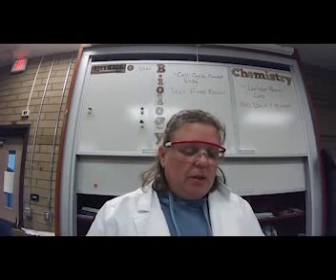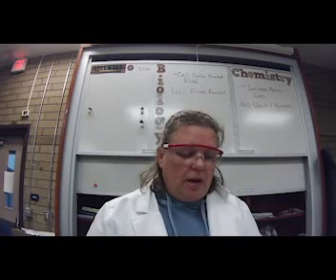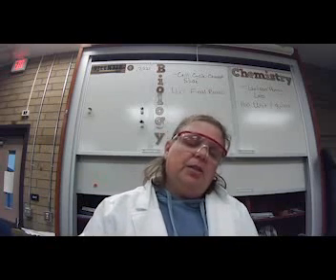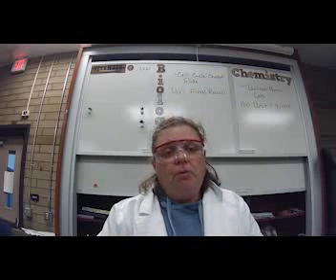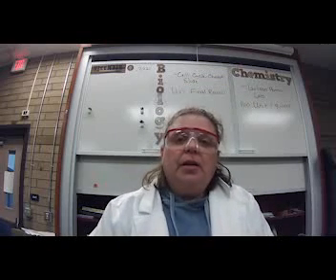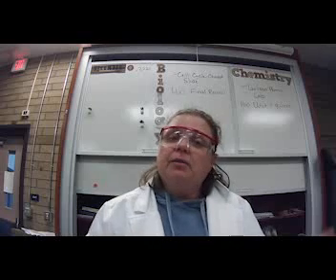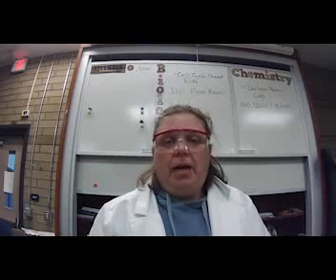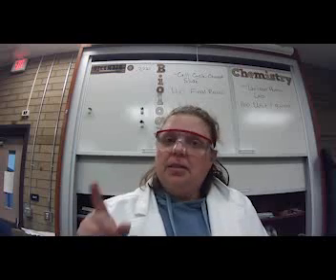And then the last one is cobalt. So you saw copper and you saw zinc, and cobalt is just to the left of those two. So based on those two, what are the properties that you should see with cobalt? Okay, all right. If you have the lab with no reactivity, that is the end. Go answer your 4 questions. If you do have the lab with reactivity, stick around.